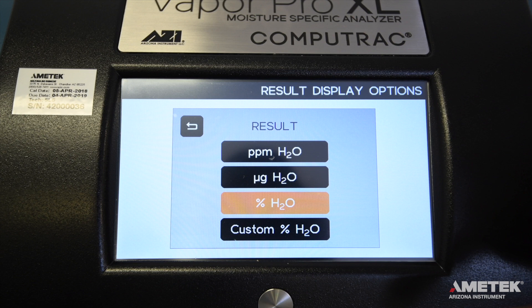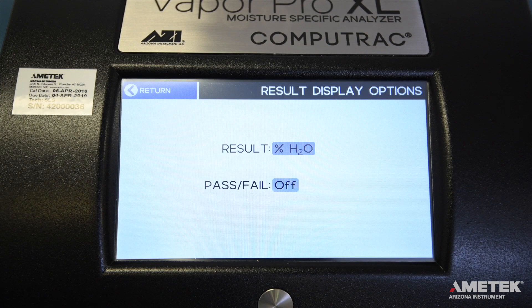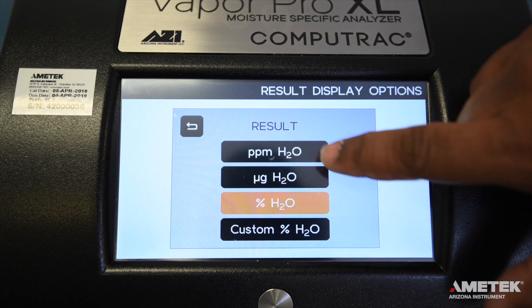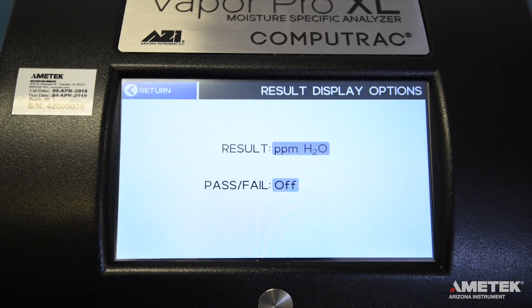Custom Percent Water is less common, but if you have questions about it, contact Arizona Instrument or your local representative for assistance. If you would like your test result to be in micrograms of water, you will not need to weigh your sample. However, if you would like your result to appear as either PPM or Percent Water, you will need to enter your sample weight by connecting or using an external balance, such as the Arizona Instrument ZSB-150. Select the appropriate result type for your sample. If you select either Percent or PPM, a pop-up will appear reminding you to set up sample weight entry on the Test Start Options screen. Touch OK to clear the reminder and continue editing.